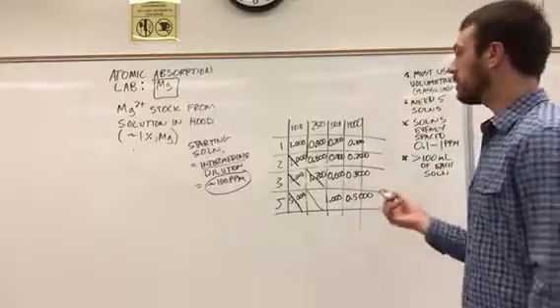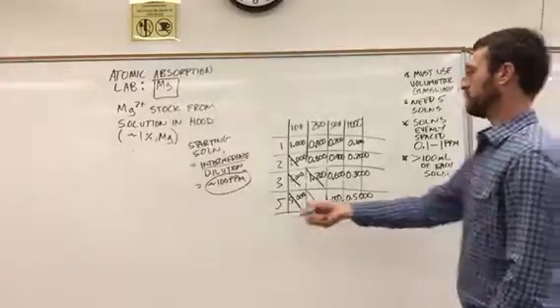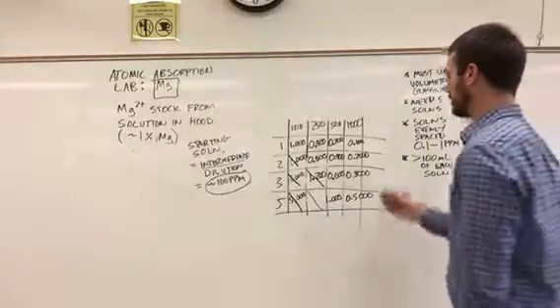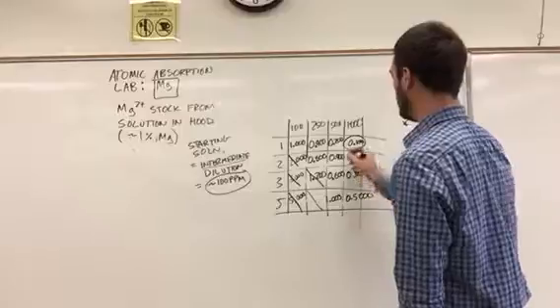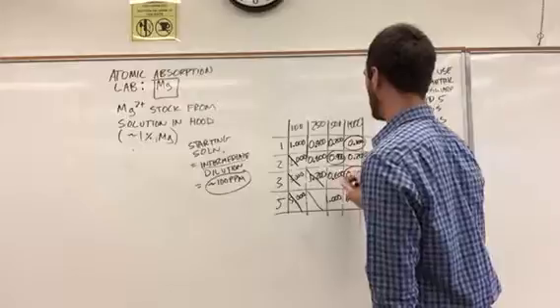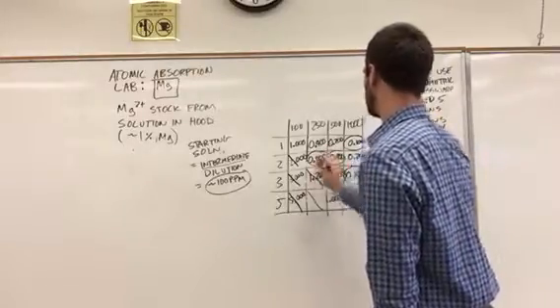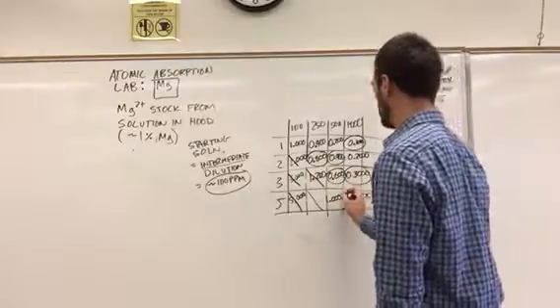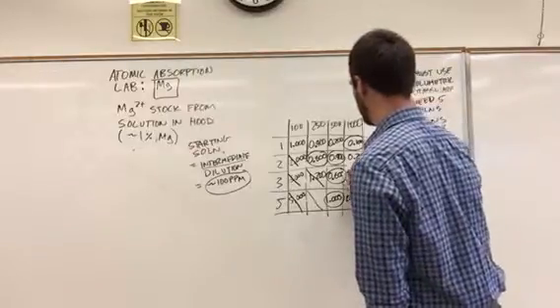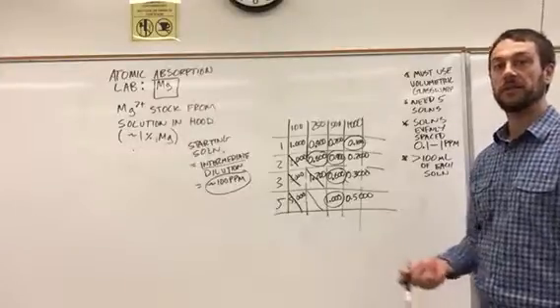And so now you can select your 5 that are evenly spaced. And in this case, it's pretty easy because we started with a nice round number. Yours are not going to be as easy, right? But for example, we can use the 0.1, the 0.3, the 0.4, 0.6, 0.8, and I guess maybe what we should do is use the 1, and then we wouldn't use the 0.3. Okay. So then those would be the 5 solutions that you would use to make your magnesium calibration curve.